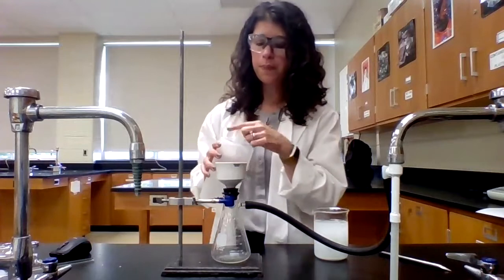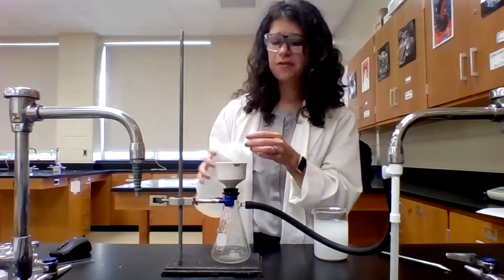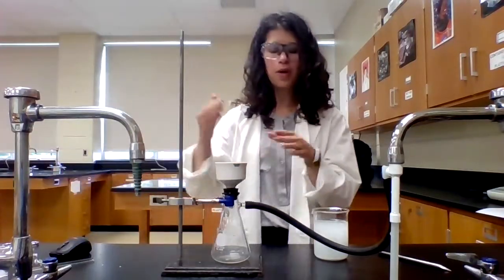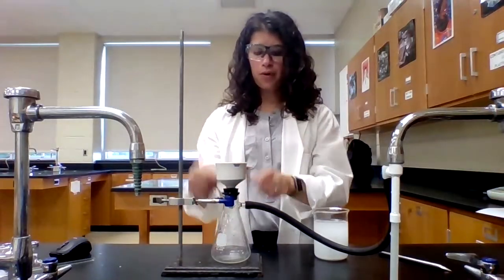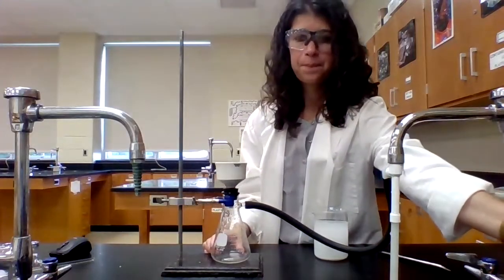I am going to add a little bit of DI water here. And the point of the DI water is just to help the piece of filter paper stick to the bottom of the Buchner funnel, because I don't want any of my product to get underneath the filter paper. I need all my product on that filter paper. Now, when I turn this sink on, you're going to see that water that I just poured is going to get sucked down into the filter flask.